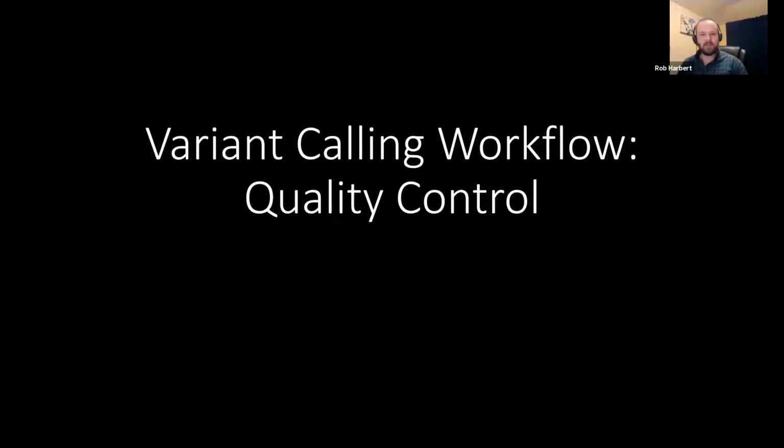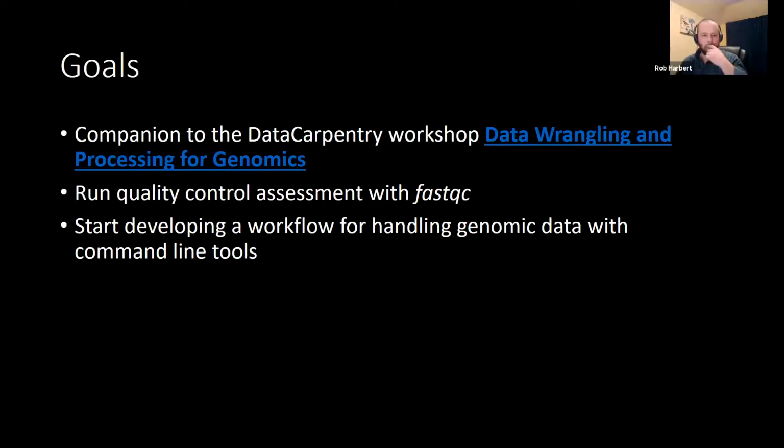using the program FastQC. This is a video that's made as a companion to the Data Carpentry workshop, Data Wrangling and Processing for Genomics. This is not the whole workshop, and it's not meant to be. This is just a recap of how to run some of the code that goes with that workshop.